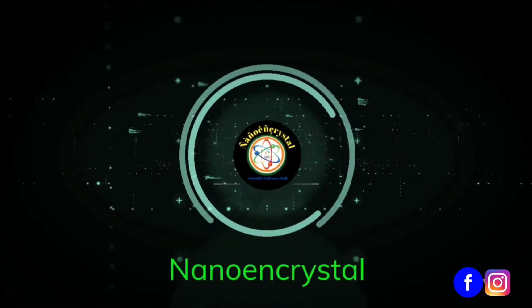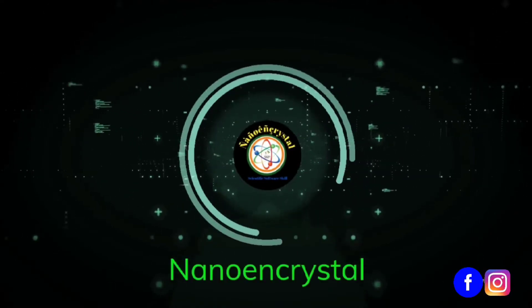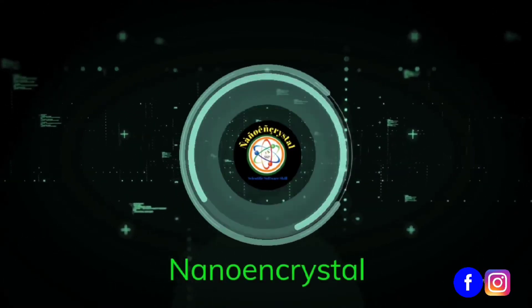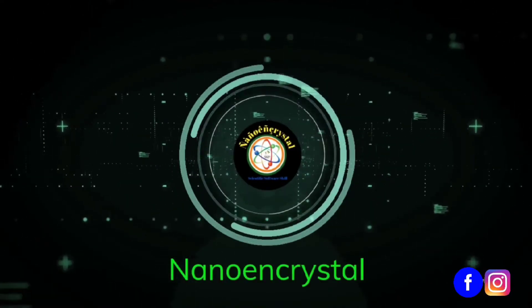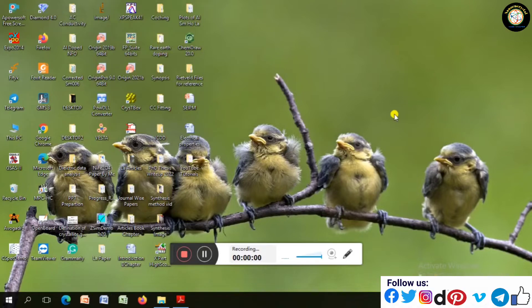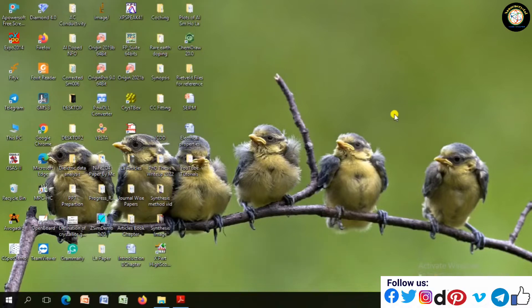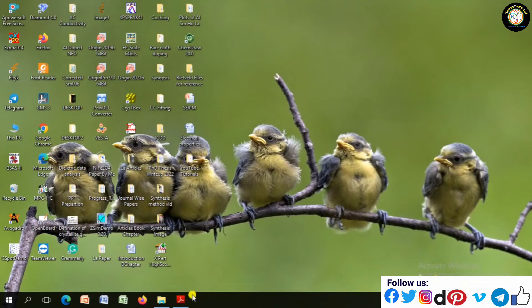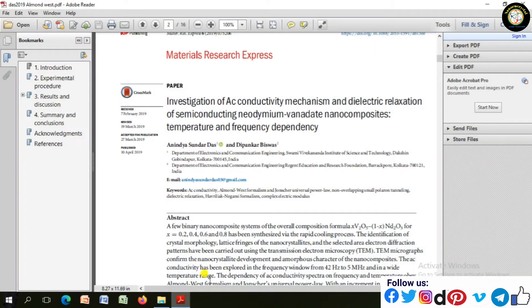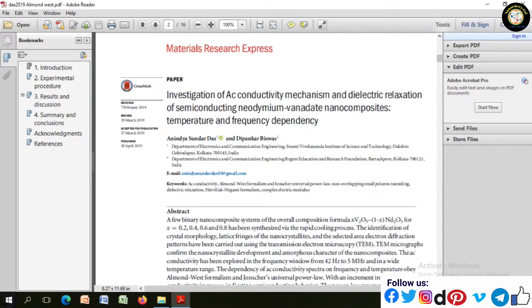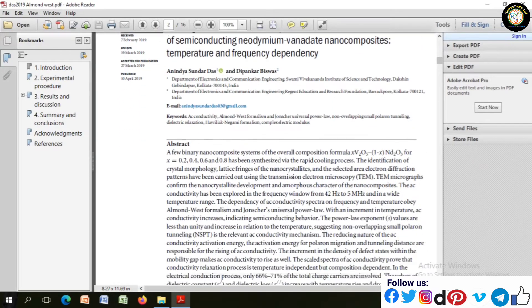Welcome to Nano and Crystal. Today, in this tutorial, I will show how to do fitting of nonlinear Almond-West formalism in the experimental data of AC conductivity, using ORIGIN software.